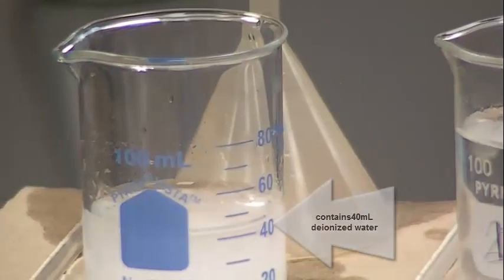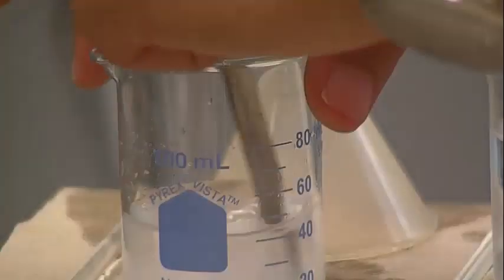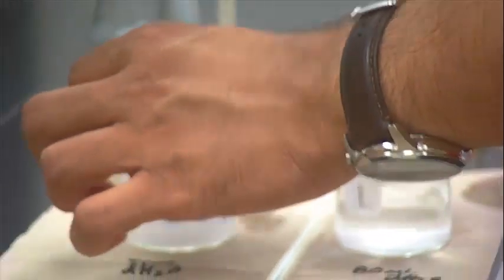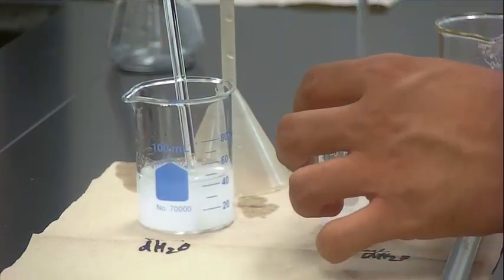So I'll add a little bit more here, a little bit more here. Roughly equal amounts are what you want added to the beakers. Stir it with a glass rod in each beaker.